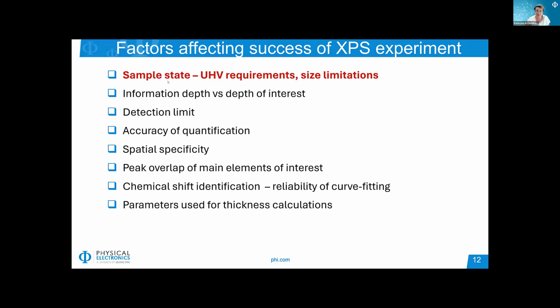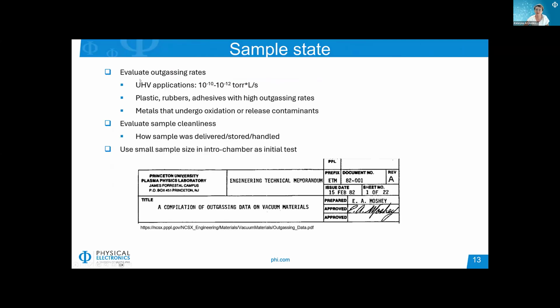So this webinar will address some of these factors. Let's start with sample state: whether you can even put your sample into your XPS system. Of course, it comes with UHV requirements and size limitations. You cannot put as large a sample as you want into your XPS instrument. So this is quite obvious.